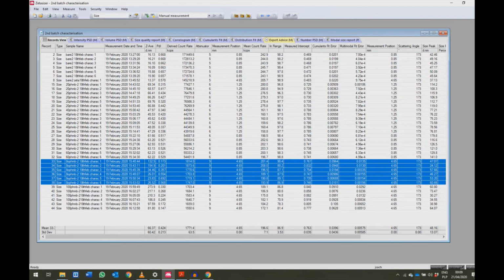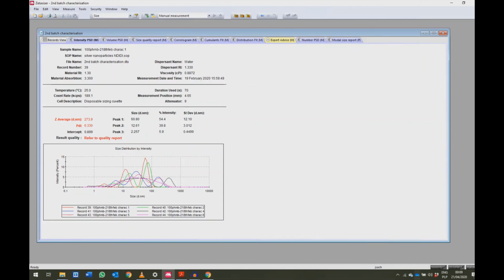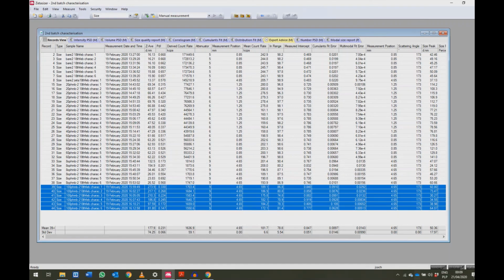But this should get you started pretty well, even with the amount of data that you've collected. You should be able to do those things, which is changing the quality of data. And so the first analysis is the quality of data itself, then changing the quality of data, and then for those samples that you can rely on the results, then you can do the sizing analysis, so distribution analysis.